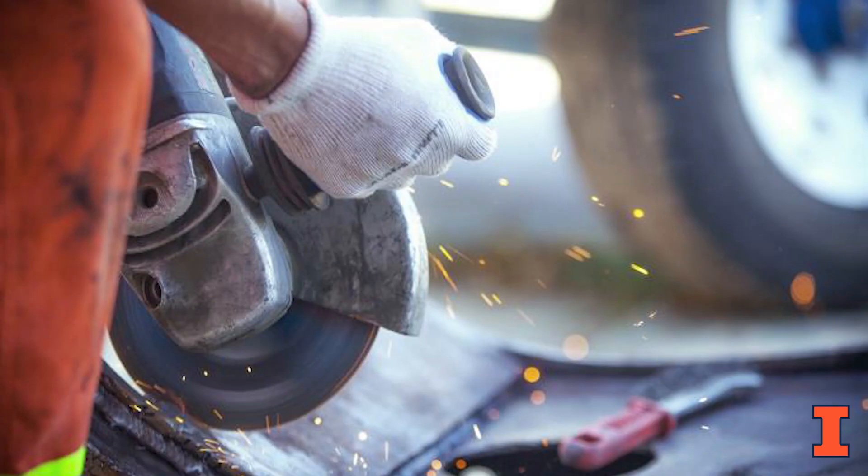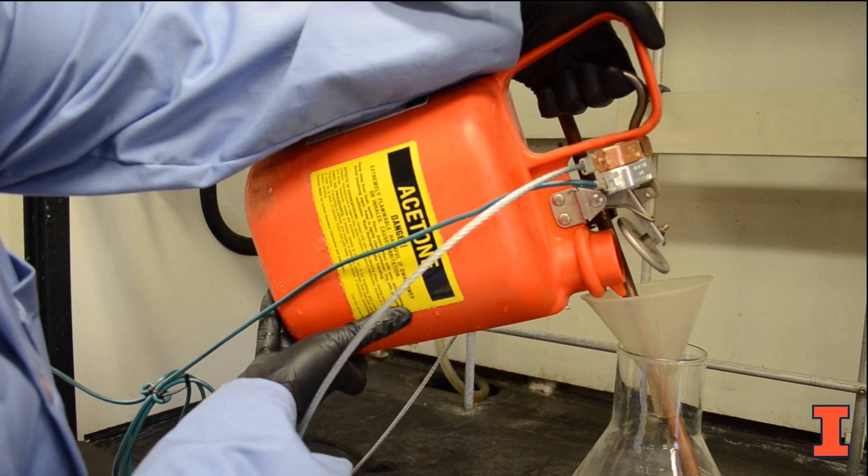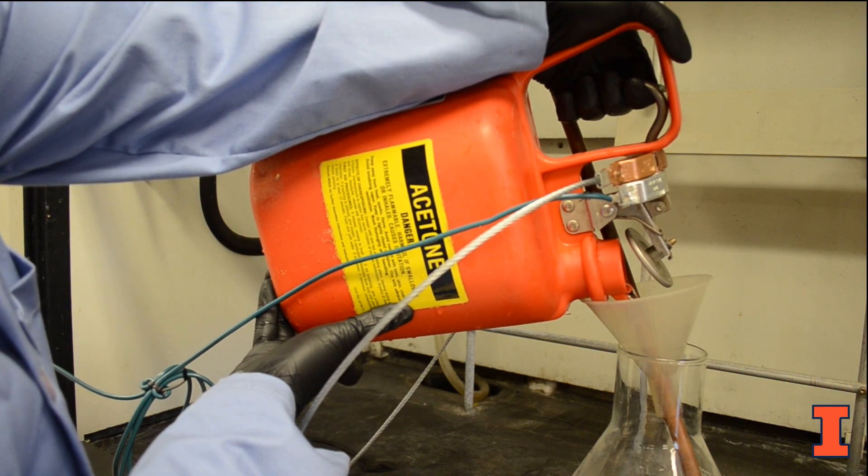Friction between different materials can cause static electricity. Liquids flowing through a pipe or being poured can create static electricity sparks, which can ignite flammable liquids with a low flash point.